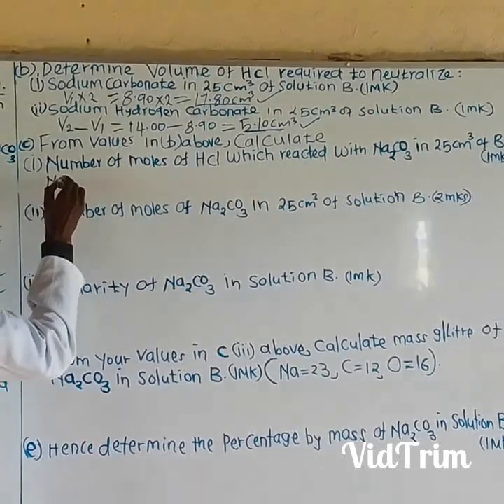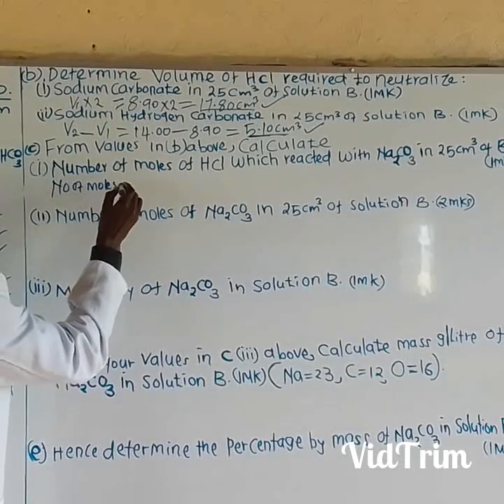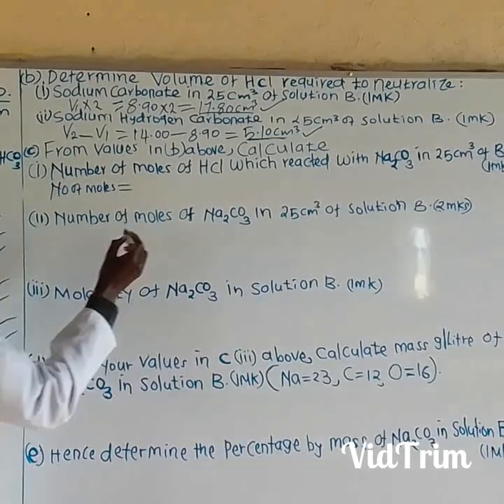Number of moles is given by this formula as usual.